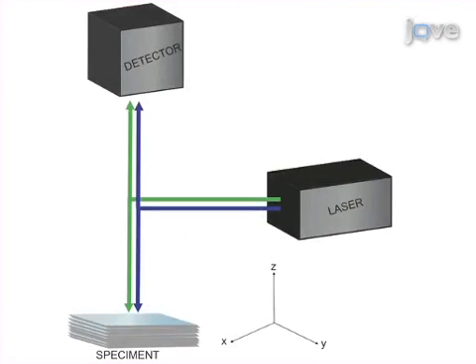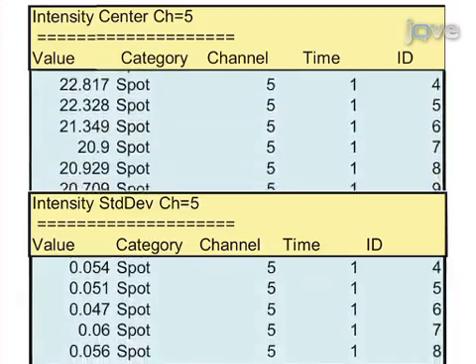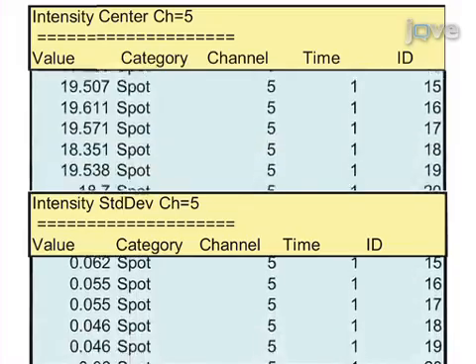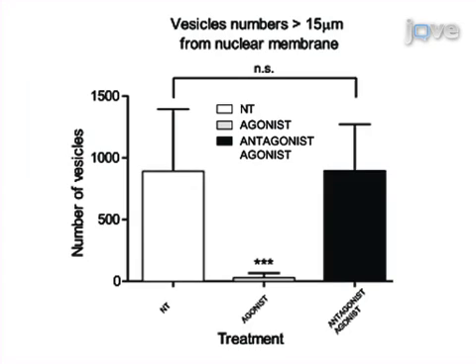The second step is to acquire multispectral three-dimensional fluorescence images. Next, three-dimensional morphometric analysis is performed using Imaris Neuroscience, ImarisXT, and MATLAB computer software. The single-cell phenotypic changes visualized through three-dimensional morphometric analysis are then analyzed and quantified as a final step. Ultimately, this software platform is used to quantify changes in cell shape following receptor activation, providing an additional tool for drug discovery.